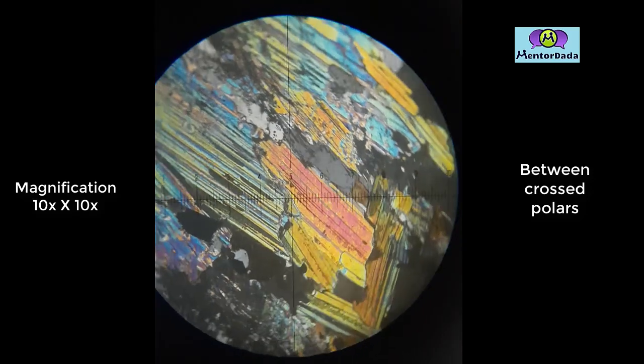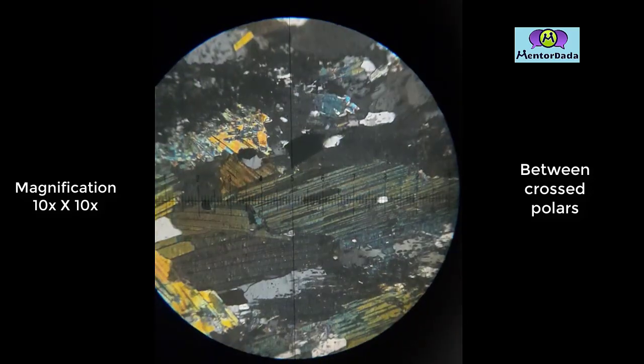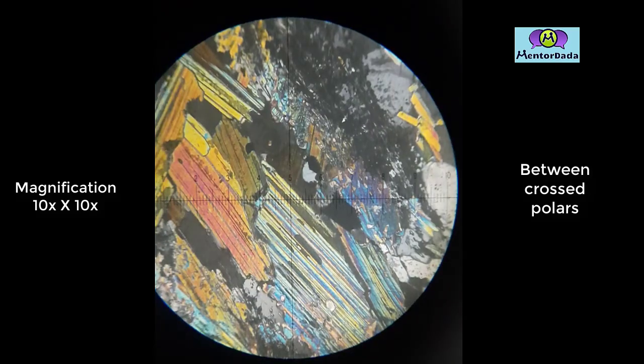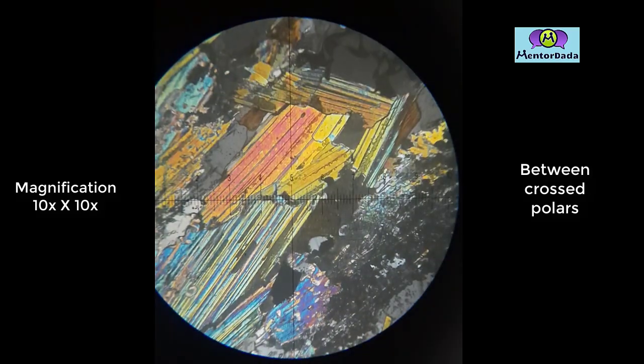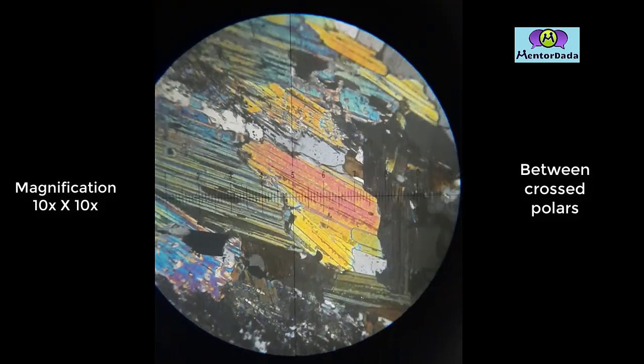Between cross polarizers, the mineral is changing its color as the stage is rotated, so the mineral is anisotropic.